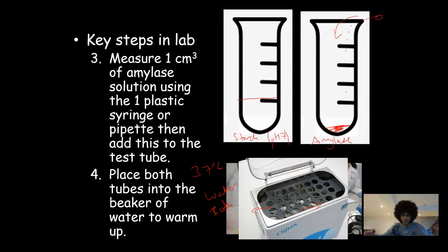It's basically like a little shallow bath where you can put test tubes in, and it's got a filament or something inside it to keep it warm. It's really, really good for a scientist. Okay, so those test tubes are inside there and they're warming up.